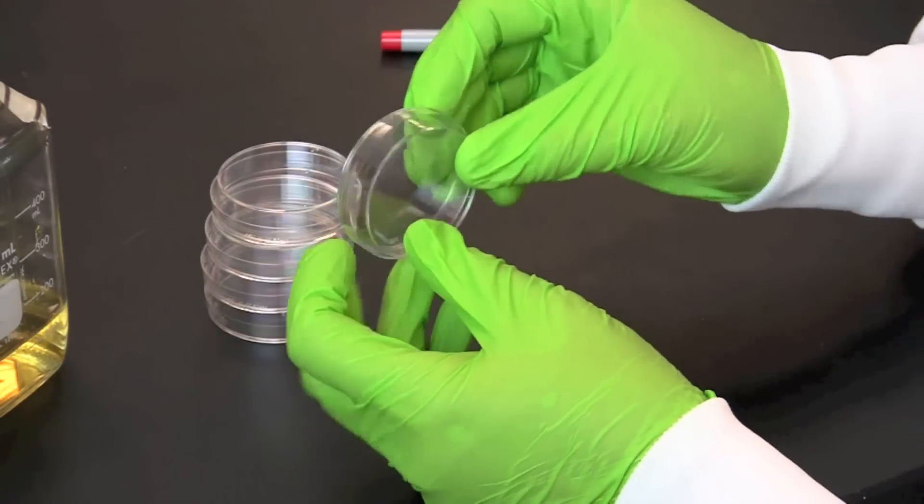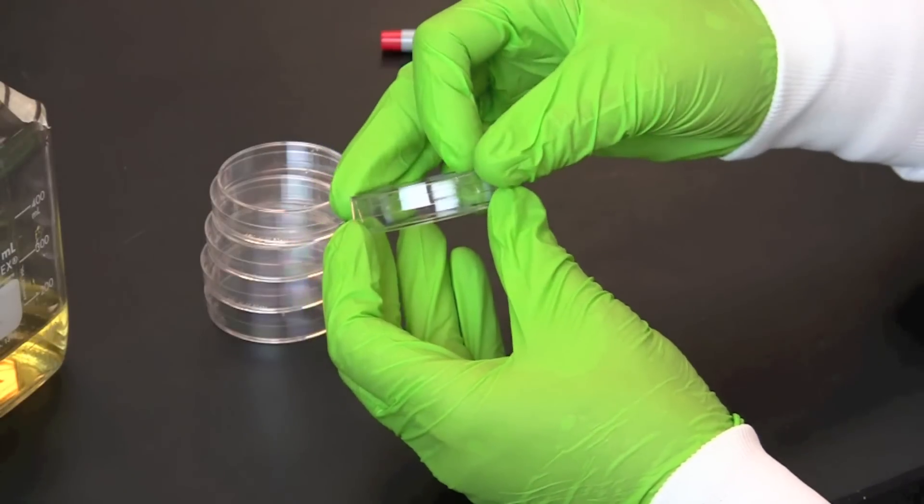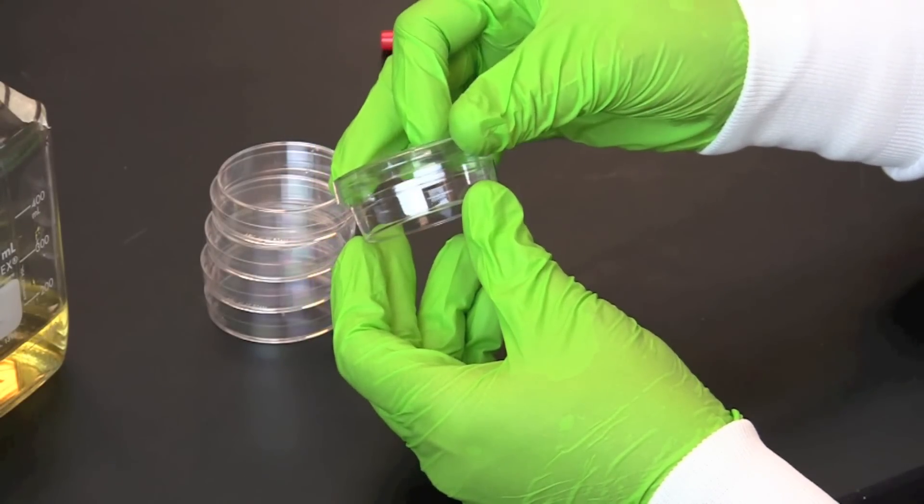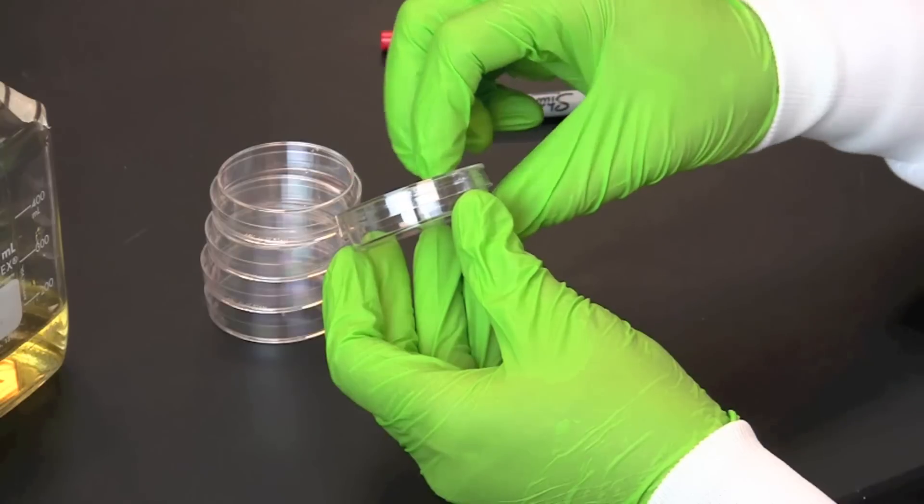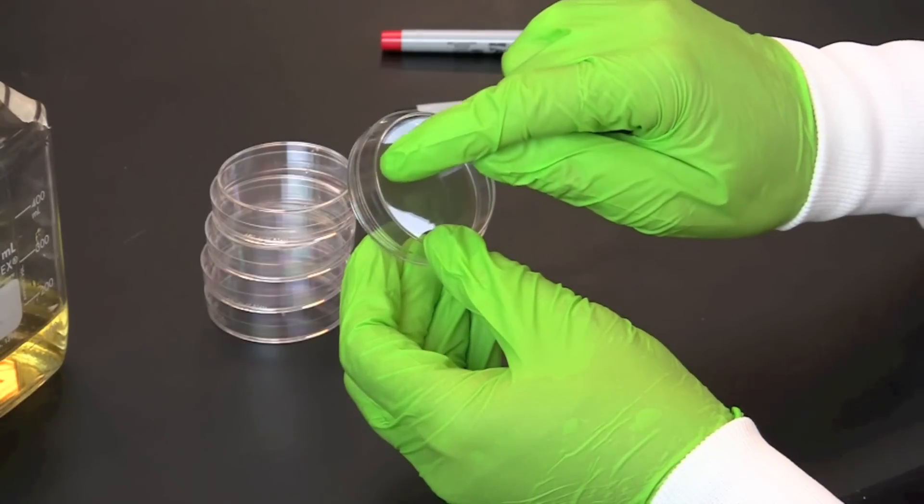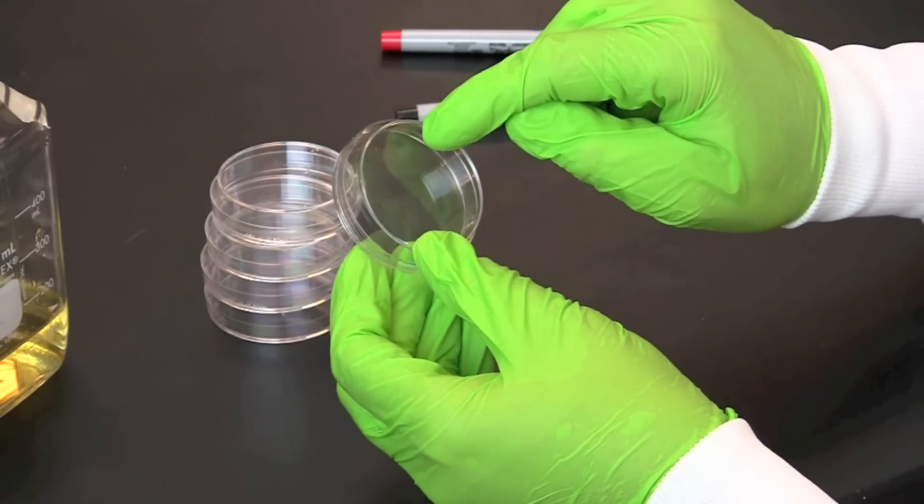We will be pouring our media into petri dishes. Petri dishes have a base and a lid. The lid has a slightly larger diameter and fits over the base. Labeling the plates is done in an arch along the outer edge of the base.